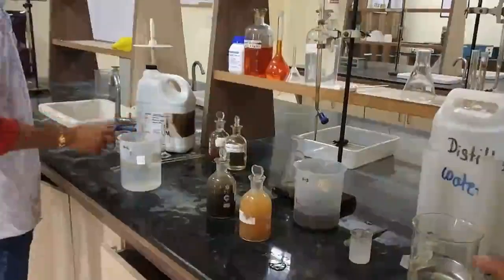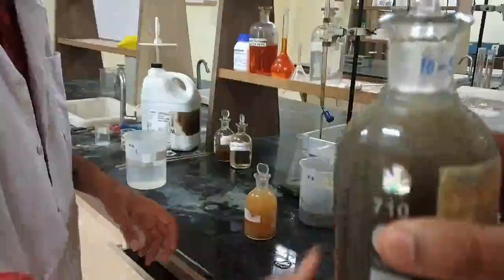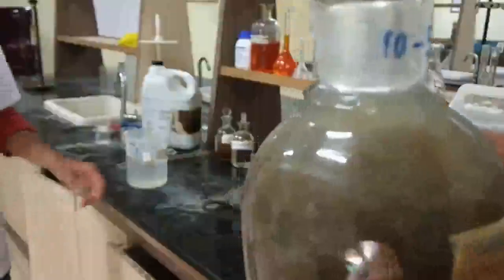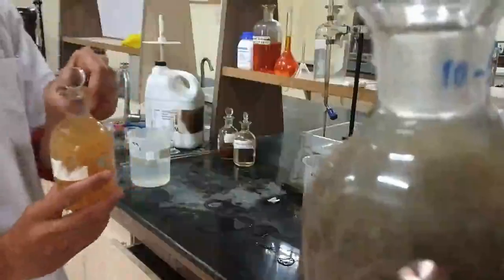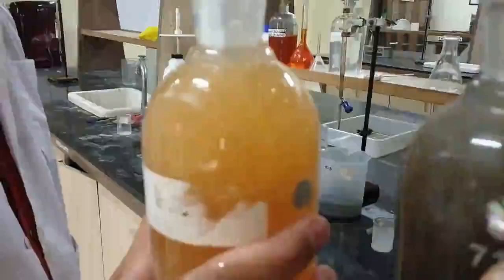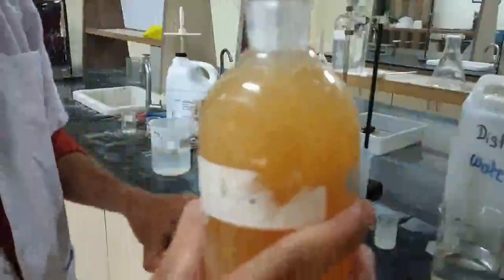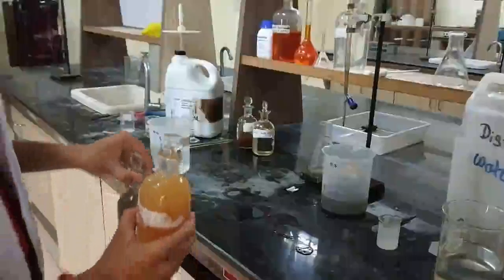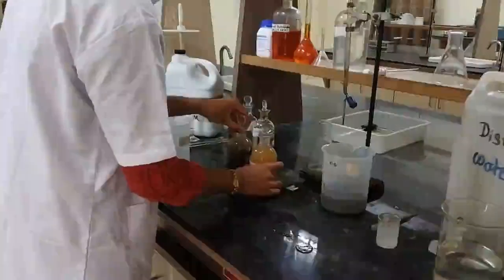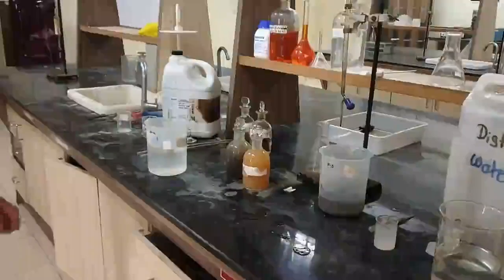Can I get the bottle? Second bottle? Yes. So here you can see there is a whitish liquid that is getting formed. So it is not a yellow PPT, right? So here you have a yellow PPT or a brown PPT where the DO is present, and this kind of color, that is a whitish color, will be obtained when you will be having the zero DO. So as the sample color is black, particularly you are not getting that white color properly, right?